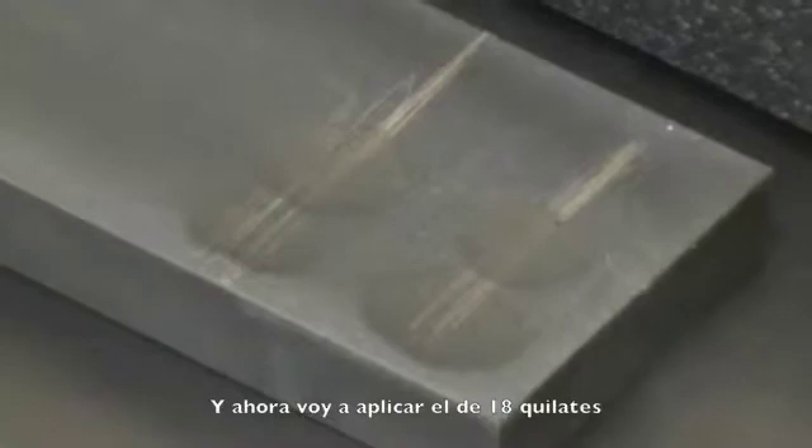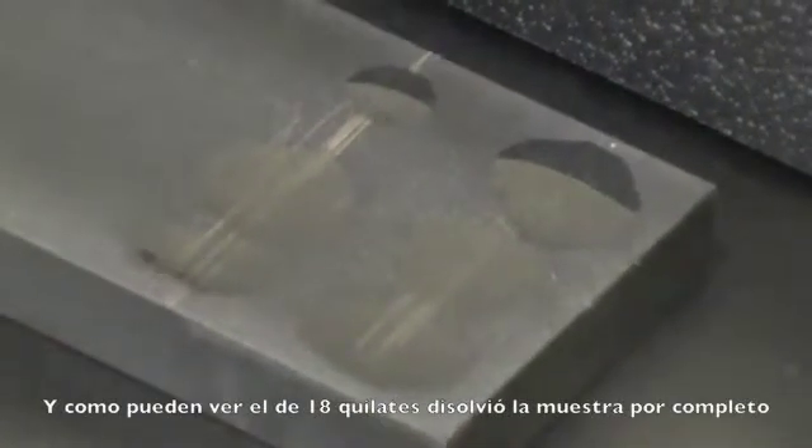And now I'm going to apply 18 carat. And as you can see the 18 carat has completely dissolved the filing.